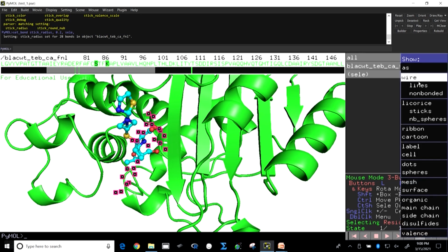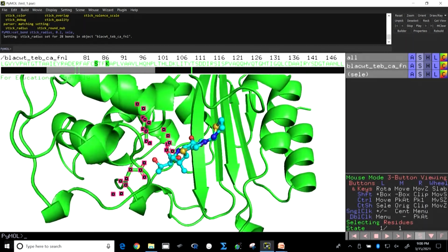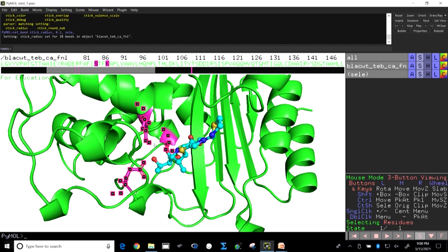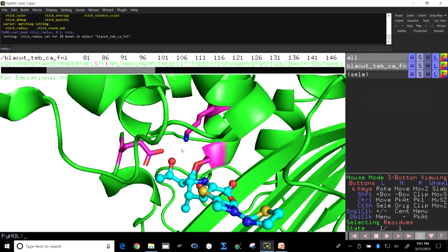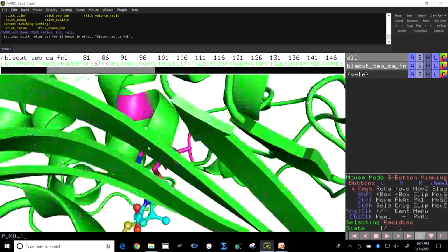So, these are the 3 amino acids which perform the 2 reactions I talked about in the class, which involve acylation and deacylation reactions. Here you see the lysine has taken the proton from the serine, and the serine attacks the beta lactam ring and forms a covalent complex, as I have talked about. So, now you know this is the active site and how those active site residues are close to the substrate, and you would see the periphery, right.